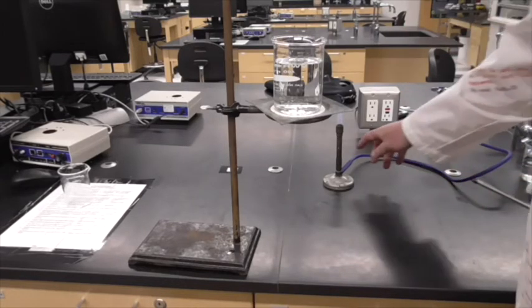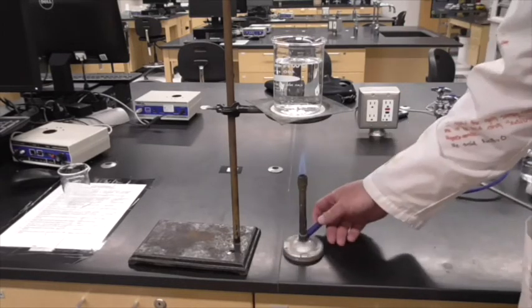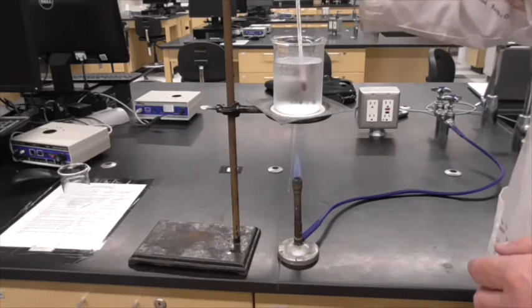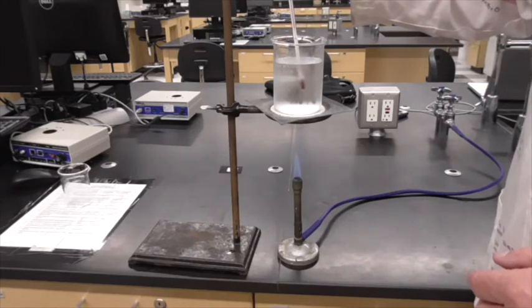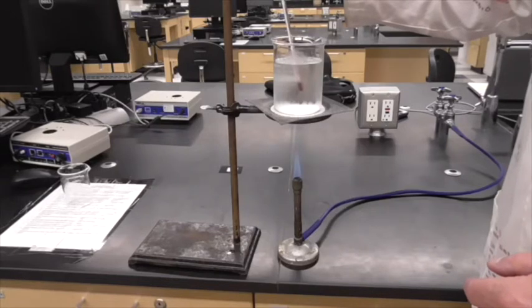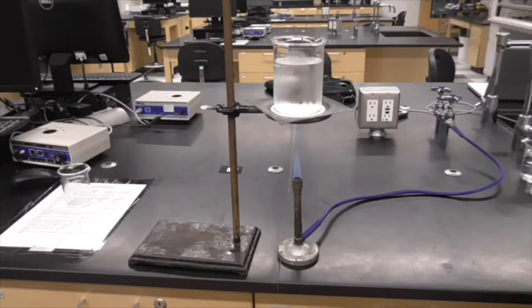All right, so I need to get this to 40 degrees. So I'm going to put the Bunsen burner under it. Let's look at the temperature right now real quick to see where we are. Right now it's about 23 degrees. So we're going to give it a couple minutes here, let that heat up a little bit, and then we're going to get our sample, put it in there, and go to it.